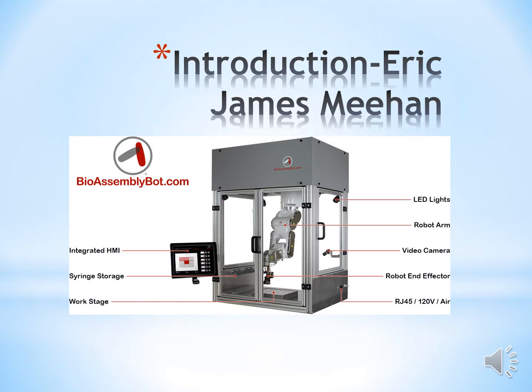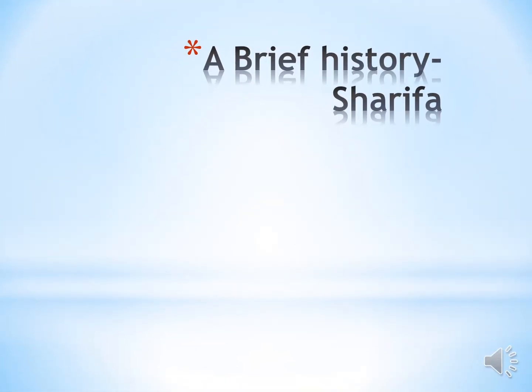3D bioprinting technology shows potential in tissue engineering for the fabrication of scaffolds, cells, tissues, and organs reproducibly and with high accuracy. Bioprinting technologies are mainly divided into three categories: inkjet-based bioprinting, pressure-assisted bioprinting, and laser-assisted bioprinting. I will now pass you on to my colleague Sharifa, where she will give you a brief history of 3D bioprinting.